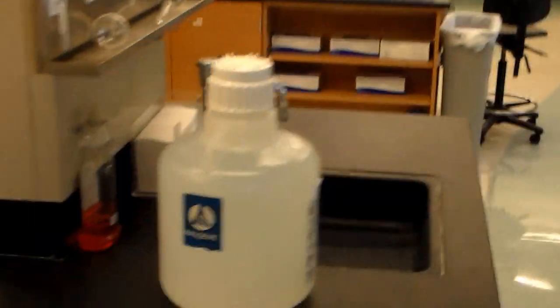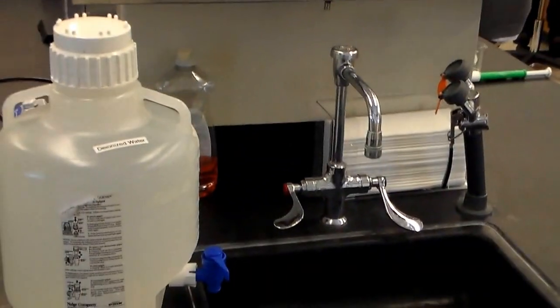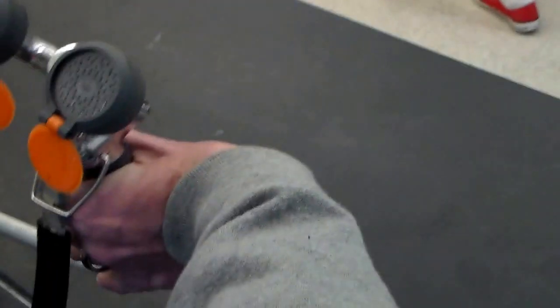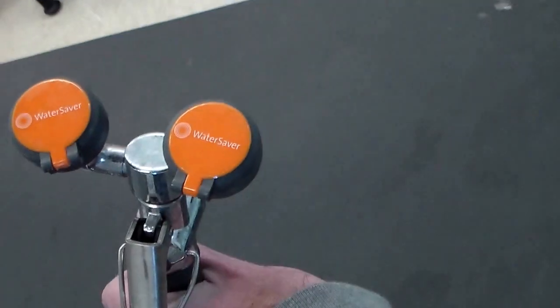Coming around the room, far corner of the room you see right there is the door where you typically come in. We have a small eye wash station right here as well. Comes out much like the hose you'd use for washing dishes in your sink. When you turn on the water the orange covers pop open. We store them closed like this to keep stuff out.